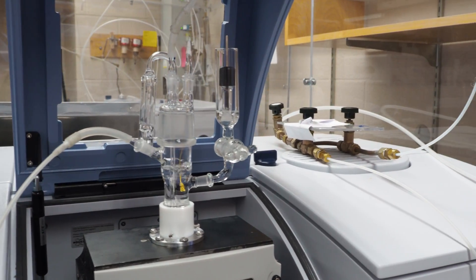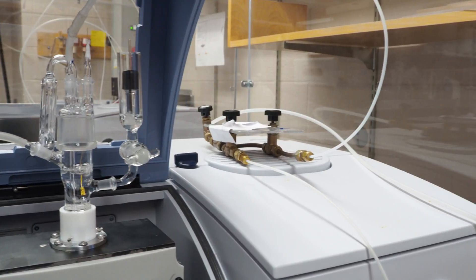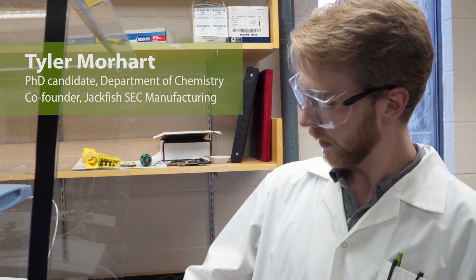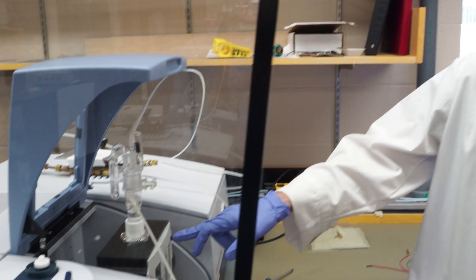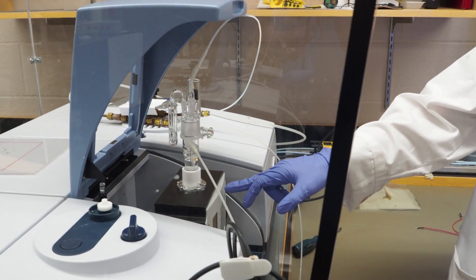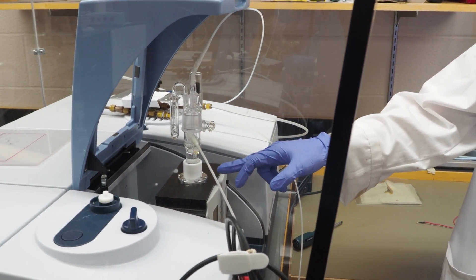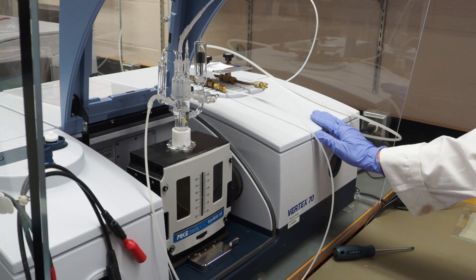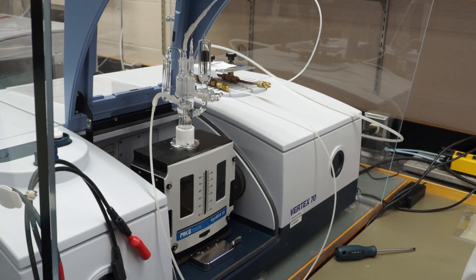The cell is now on top of what's called a VMAX 3. It basically is a piece of optics sold by a company named Pike that focuses the light at the silicon crystal we showed you earlier, so we can see what's going on at the gold film. All that light is coming from the infrared spectrometer here, and that's what allows us to do our experiment.